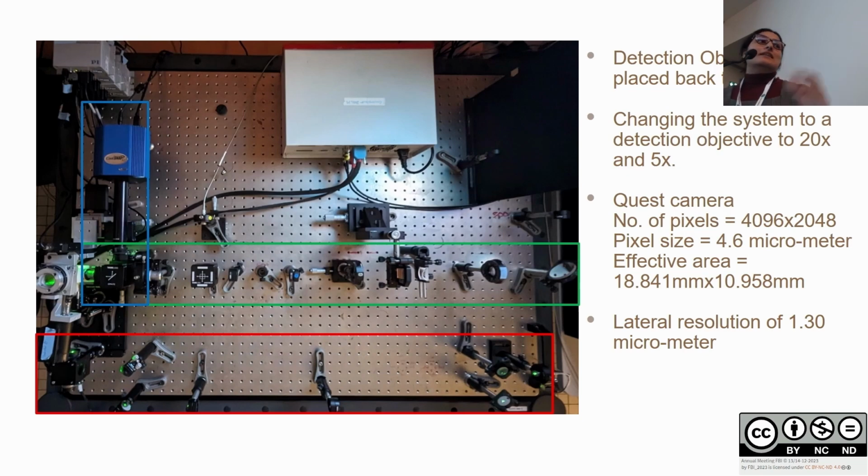So how is the digital line scanning going to happen? If I'm able to conjugate the frequency of the galvo mirror with the frequency of my camera, that's going to give me a rolling shutter option. The QCMOS camera has the option of a rolling shutter, where you can control the frequency of your shutter. So when I illuminate my sample with a scanning of my galvo mirror, I can do the same with the rolling shutter and therefore have digital line scanning.